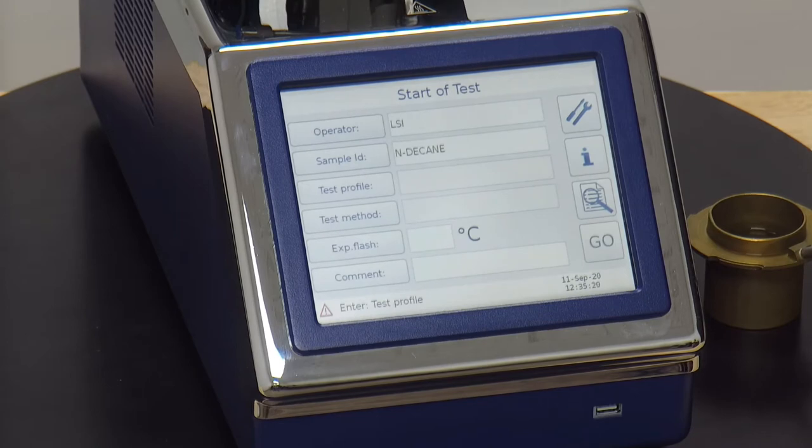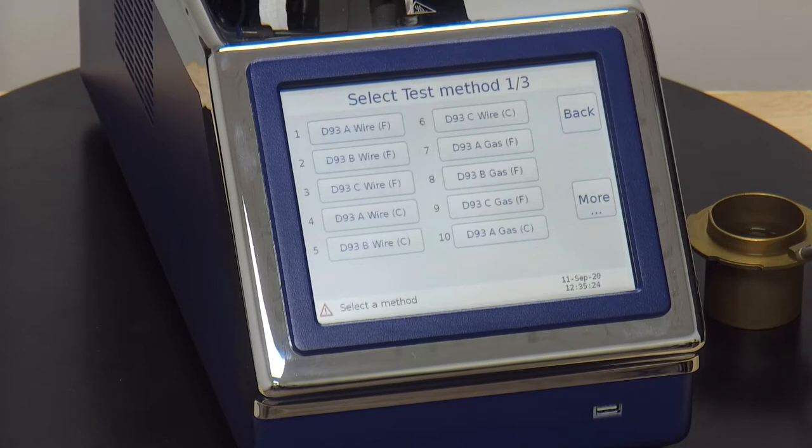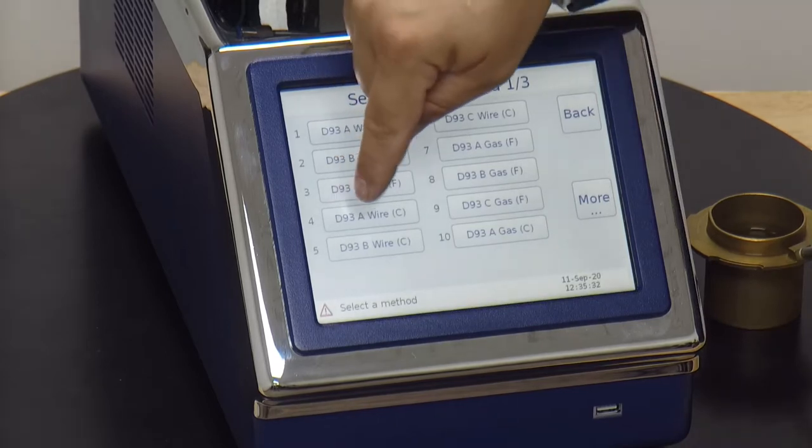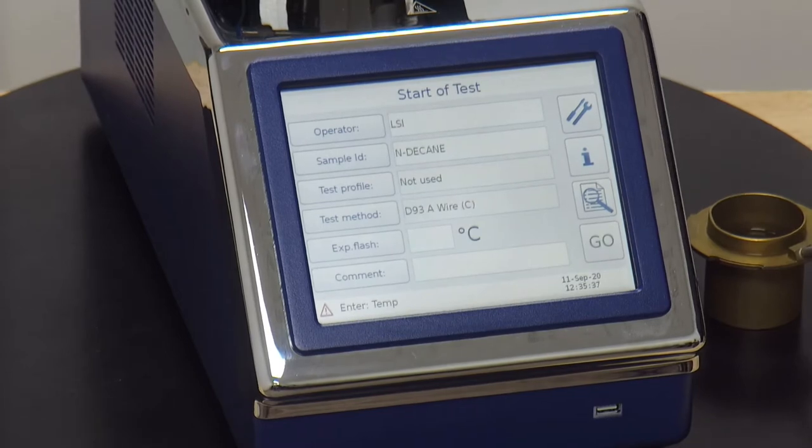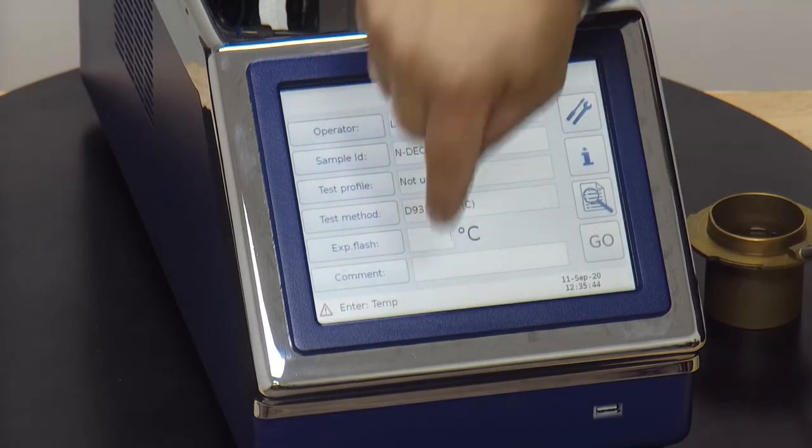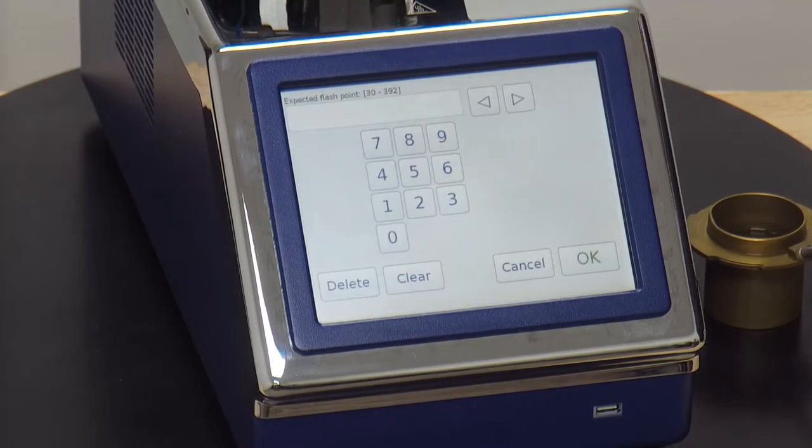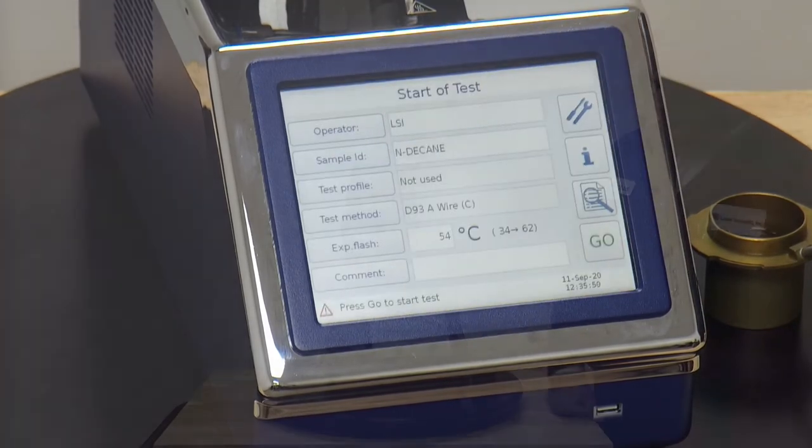At this point we'll skip over test profile and head to test method. We will select D93A method for wire and we will run this one in Celsius. So we'll select D93A wire, C. At this point we'll put in the expected flashpoint for your sample. Your sample needs to be at least 26 degrees below the expected flashpoint for it to start. Press OK.